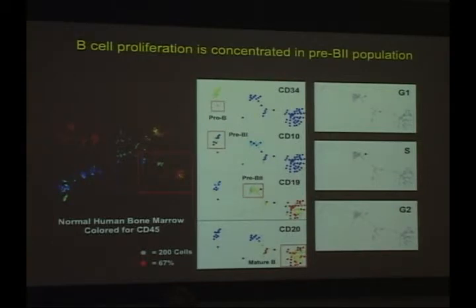So what are these populations gated on? CD34, CD10? Yeah. I mean, essentially, I color the tree just as you see here, and I use that information. I can pull up the biaxials for any of these groups, but I use that information to determine which cells are which. The clustering's not perfect, so one could argue, well, is every one of these cells really a pre-B1? There's some here that don't have a lot of 10. And you can make those arguments, and it's probably true. But you can obviously go back to the data and manually gate it, and then look at it and show biaxial plots, and I have all those.